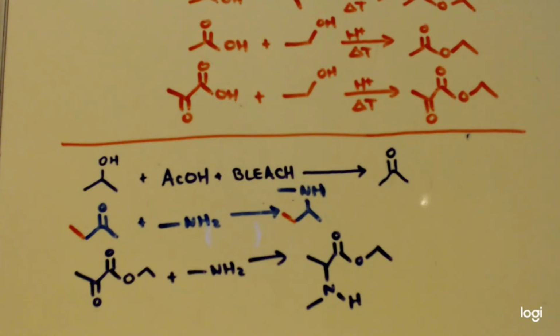Not least, bleach oxidation. Like I was saying before, to make an aldehyde usually relies on an oxidizer that is based on chromium. And I don't like those oxidizers. So I'm trying bleach. The actual oxidizer is hypochlorous acid, but you make it by adding them together. I've done this experiment, so I know I'm going to put this up on the video, definitely, because I did it like 10 times. You can't make an aldehyde. You can make an aldehyde doing this, but you need a catalyst.